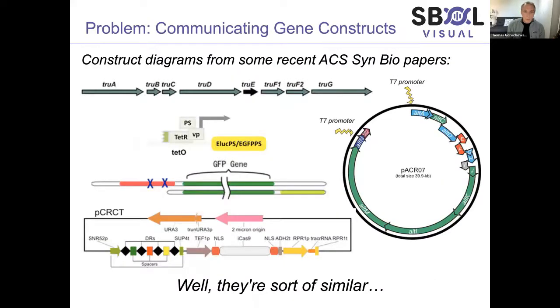So to begin with, I just wanted to highlight a problem, and this is the rationale behind why we started to create SBOL Visual. And that's the fact that when you look in the literature, and this is probably from maybe even 10 or 15 years ago, you find that there's a real mixture of ways that DNA or genetic constructs are visualized.